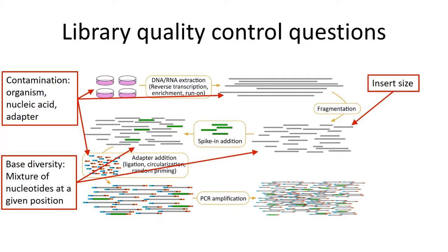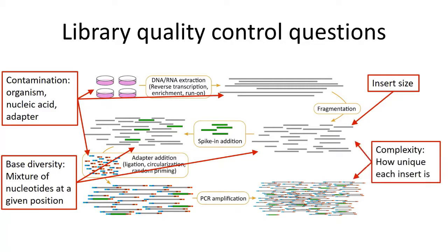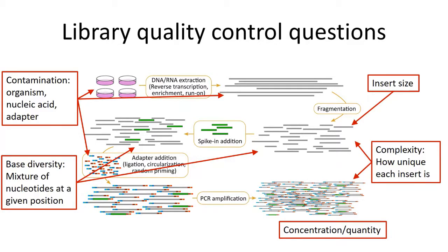Another point of troubleshooting might be base diversity, which is the mixture of nucleotides at a given position. This is hard to prepare for other than making sure your indexes are relatively well distributed in terms of base diversity, but it is something that could be a problem in your sequencing run to come back and think about. Another thing to think about is complexity, which is how unique each insert in your library is — this is very protocol dependent. In some libraries, low complexity is a sign of PCR over-amplification or some kind of bias in how your library has been processed. Finally, concentration or quantification of your library is something you can assess in a variety of ways, and your sequencing core should be able to help you with.